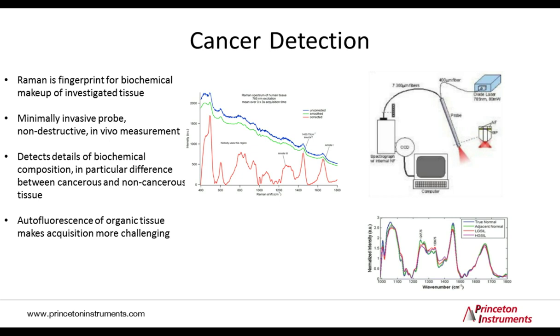The higher resolution Raman spectrum that is shown in red can, however, be recovered after correcting the spectrum using hardware and/or software techniques. For example, typically a high excitation wavelength is used. 785 nanometers is very common to minimize the excitation of broadband fluorescence that can build this background.